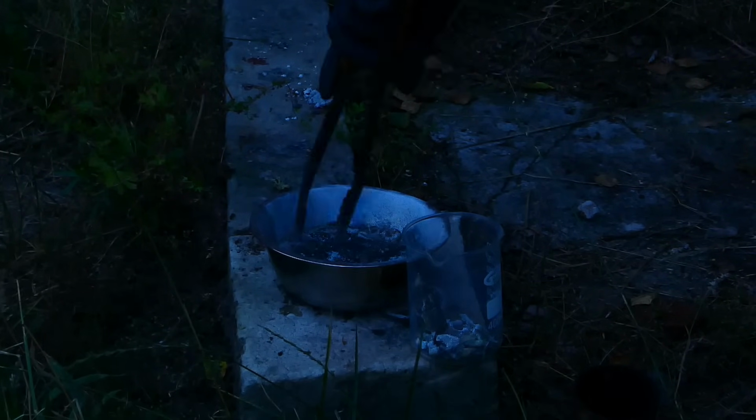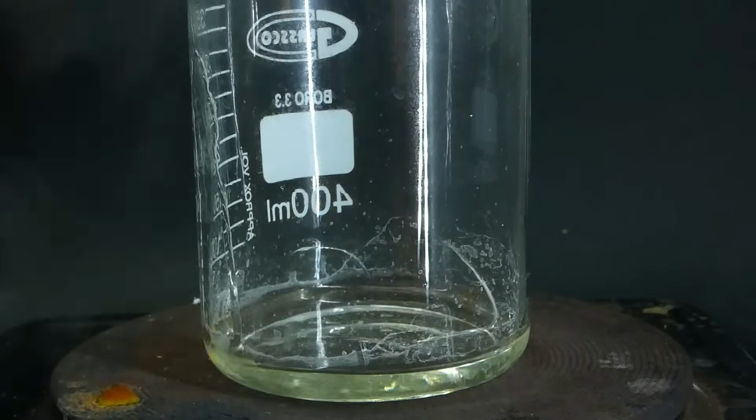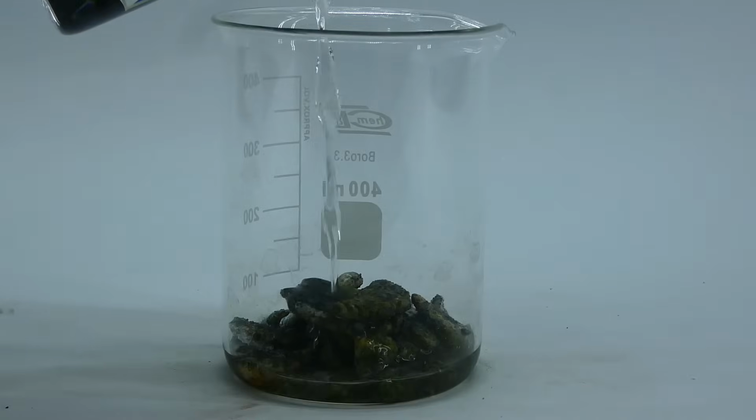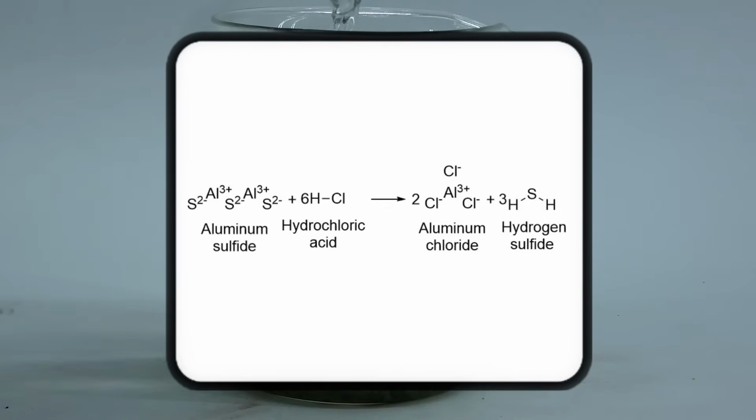After it cooled down, I got the beaker that I broke in the fluorescing video as a potential sacrifice and collected the hot reaction product. I'll then let it cool to room temperature, and the next step was to add about 100 ml of concentrated hydrochloric acid. The acid reacts with the aluminum sulfide, forming aluminum chloride and hydrogen sulfide.